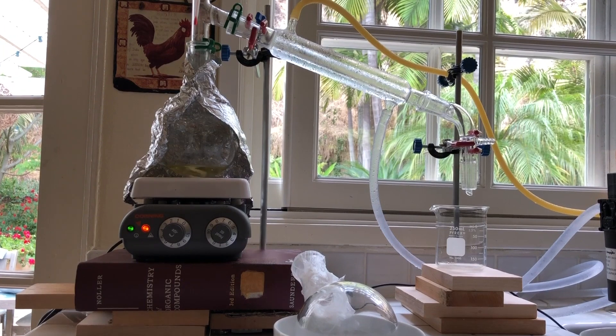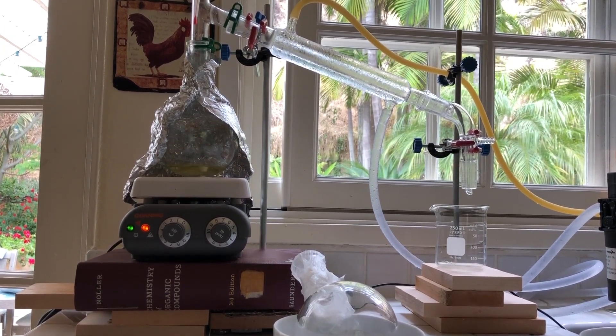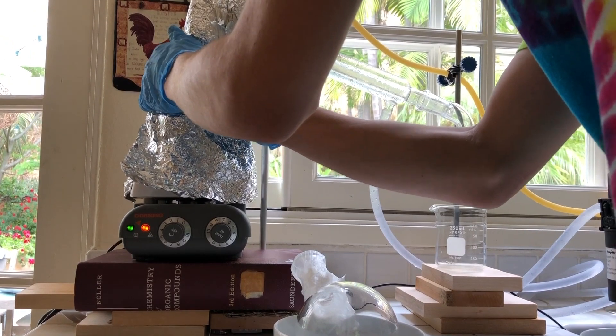Because of my mistake with the azeotrope, I still had a lot of benzene in the forerun beaker. So I simply drained as much of the orange liquid as I could into the waste container and poured the dirty benzene back into the flask for redistillation.